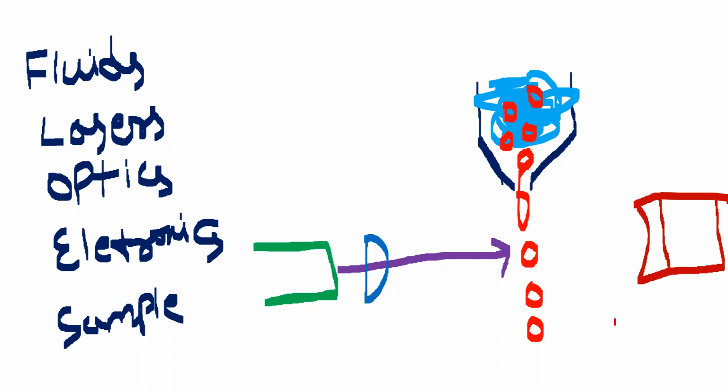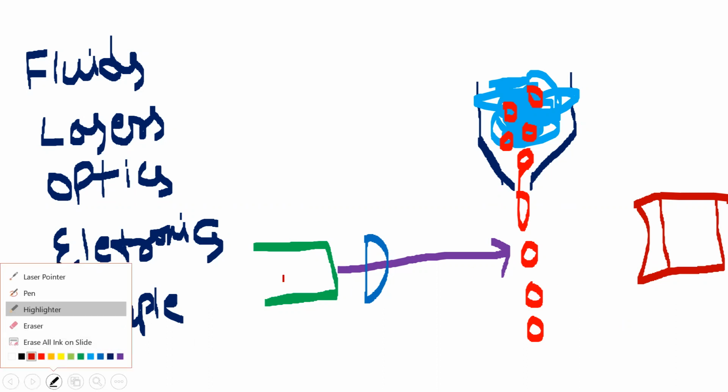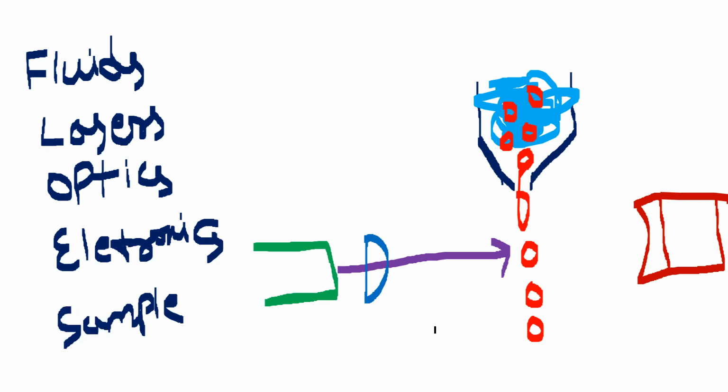Now listen, students, very important. I know the intensity of light that I transmitted onto the cell. For example, let us assume 100 lumens is the intensity of the light when I focused it onto the cell. Just opposite to the cell, I kept a detector.